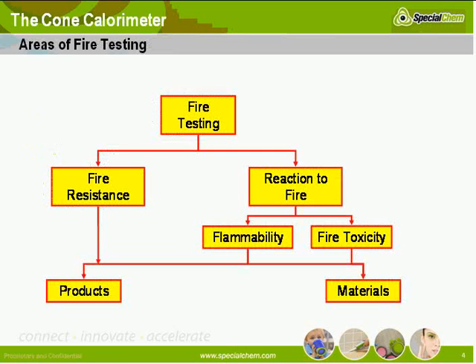We should now be on areas of fire testing, where we've got a small map, and I was hoping to point this through with you. Fire testing can be divided into fire resistance testing, where we're looking at the structural integrity of components.